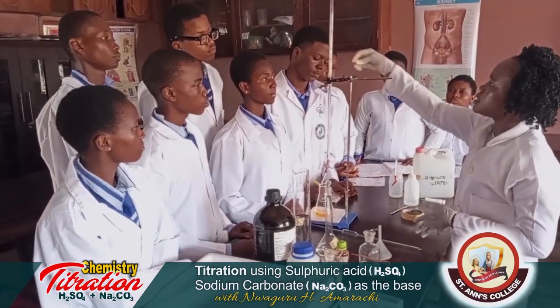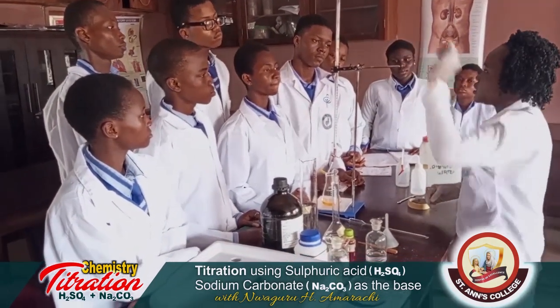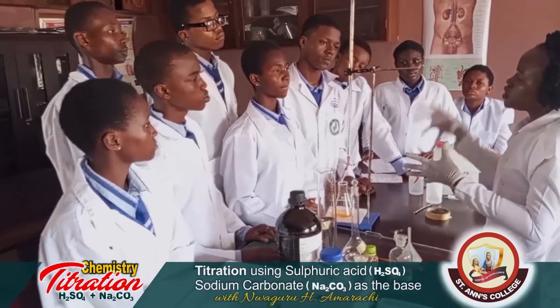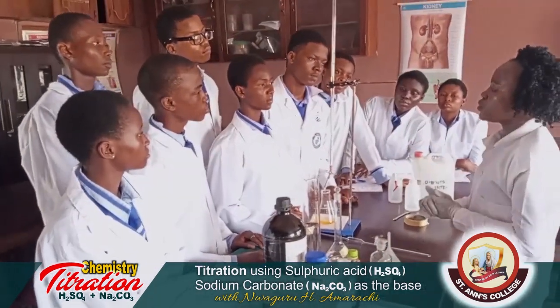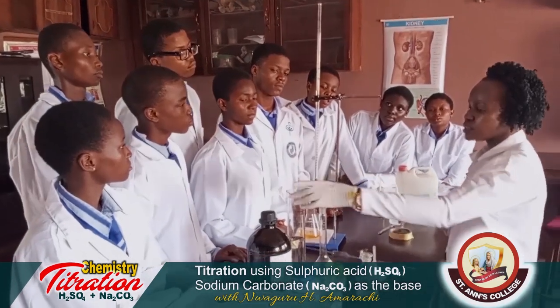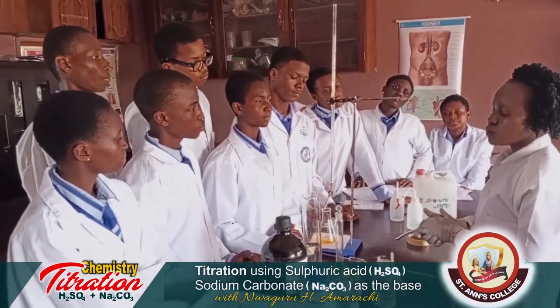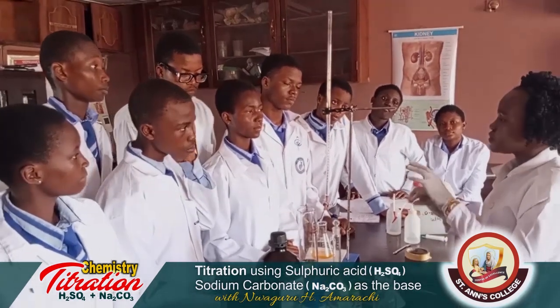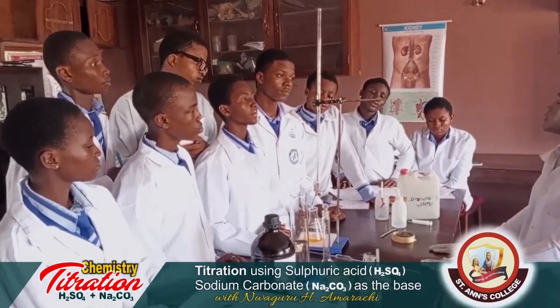So there is a possibility that some distilled water remains inside. When you add the acid, it will add more dilution to the already diluted acid. So you take that precaution so that you won't have variation in your calculation or in the value you are picking from the readings.